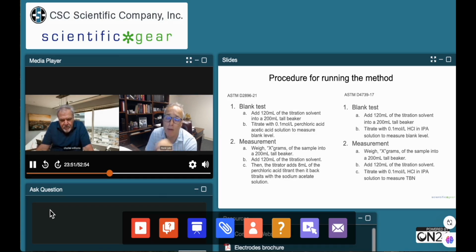It's either going to have two onboard burettes or it's going to have a burette and an APB dosing the sodium acetate solution. So just know that the configuration setup, and I think that I was kind of building towards that. I don't know if I really nailed it, but that particular method is more involved. It requires two burettes, two reagents. It's doing a little bit more, and we're going to talk about what that is.